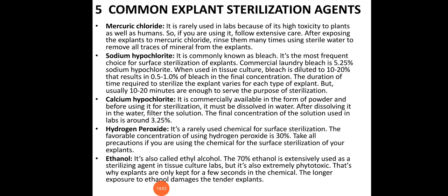After exposing the explant to mercuric chloride, rinse it many times using sterile water to remove all traces of the mineral from the explant. Second, sodium hypochlorite, commonly known as bleach. It is the most frequent choice for surface sterilization of explants.